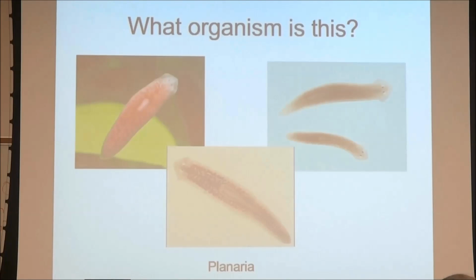Dugesia. It's D-U-G-E-S-I-A. All right, so it's got two names. Planaria.